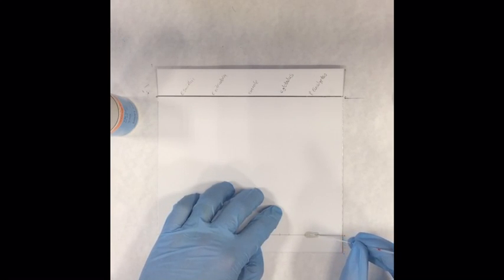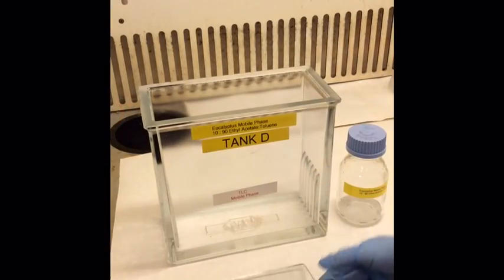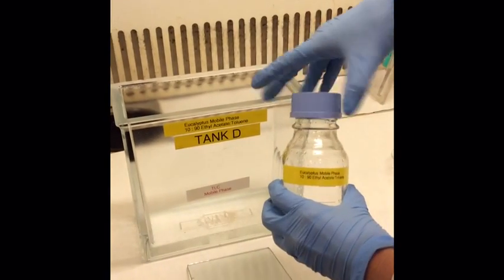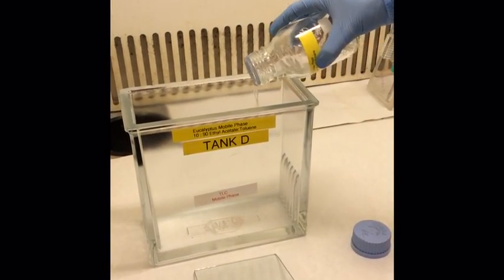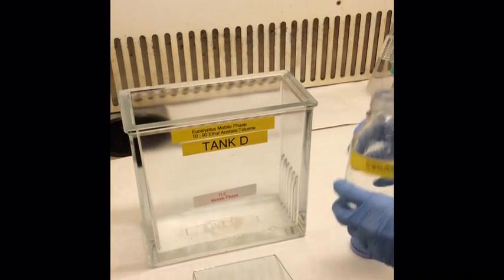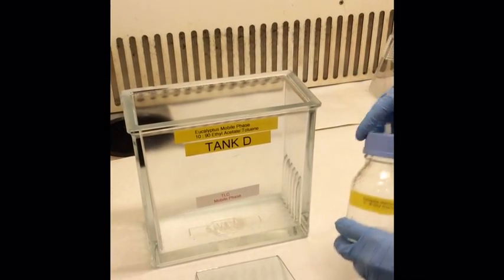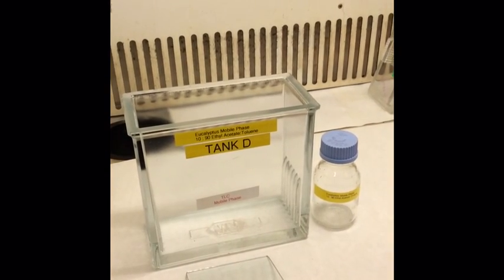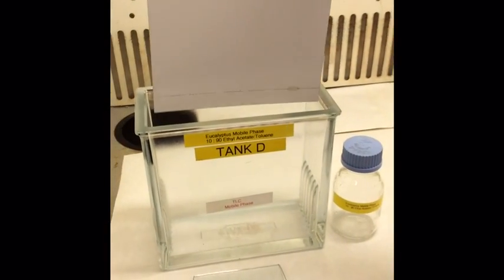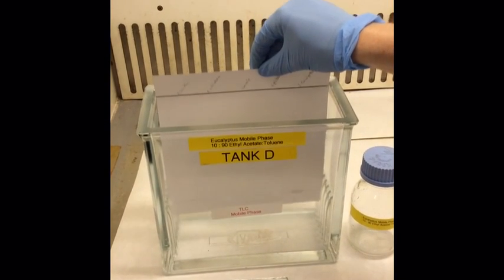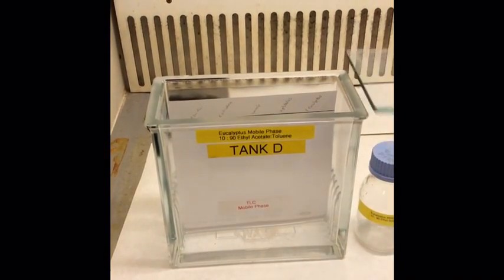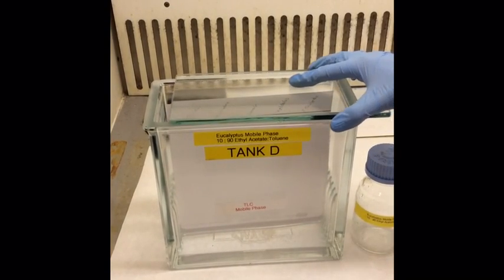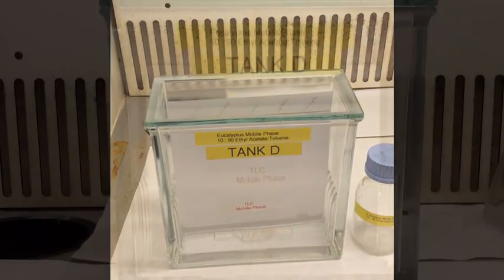Once you've spotted all the different spots on your TLC plate, you can then place your plate inside the TLC tank. Carefully remove the lid of the TLC tank and then add in your mobile phase. Add your TLC plate inside the TLC tank. Once you place the lid on top of the tank, it is important not to open the tank until the plate is fully developed.